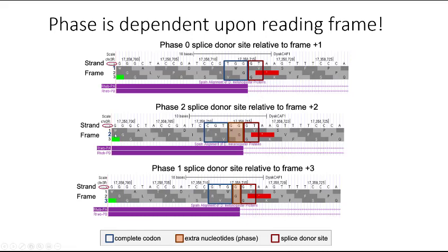However, for this exon, if the correct reading frame was reading frame 2, we would look at the middle line here for the correct encoded amino acids. If we look at where the very last full codon is, you would see that it's that R, which is encoded by CGT. That's the last full codon in that exon. And there are actually 2 extra bases after that: 2 Gs that are part of the exon, but are not part of a full codon. And so the phase of this one, if it was in reading frame 2, would be phase 2.